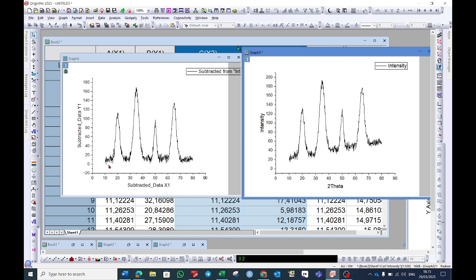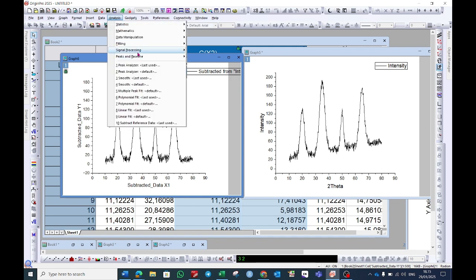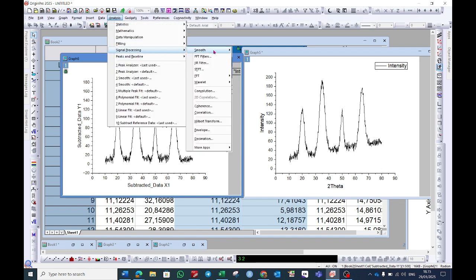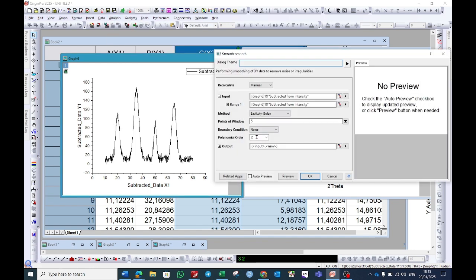But as you can see in the data, there is a lot of noise. So we will quickly remove the noise. Go to analysis, go to signal processing, choose smooth and open dialog.